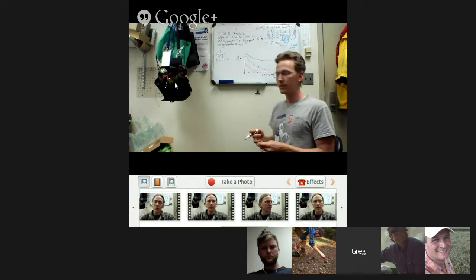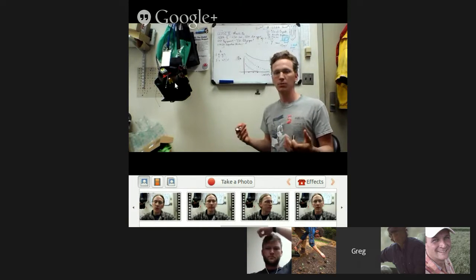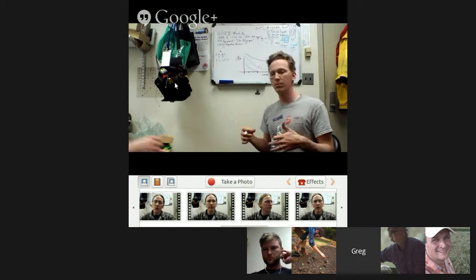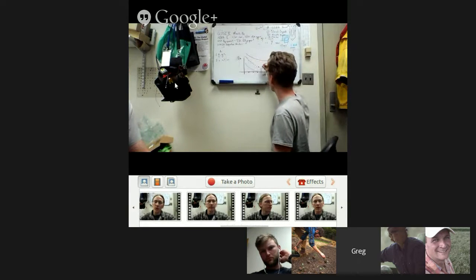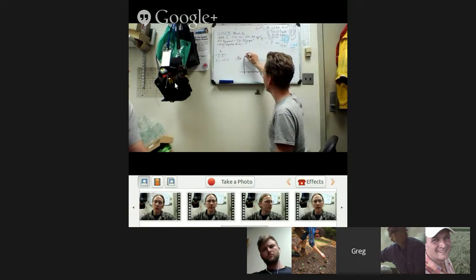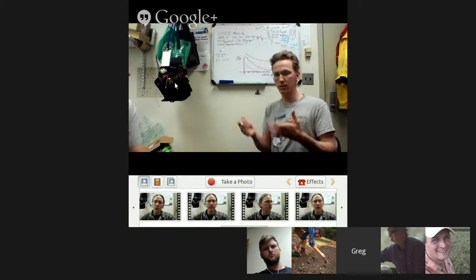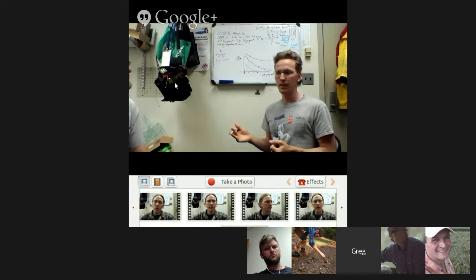So that's why we see this as an opportunity, because in the world where we have a community across the world that's capable of taking large numbers of measurements, we can start to collect more of this data and really fill out this curve. Whereas if you were using the traditional LICOR, a $60,000 instrument that's really slow to use, it gives you very accurate data, but it's very slow.